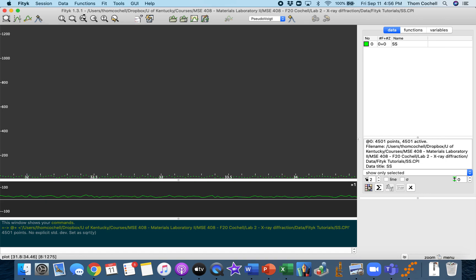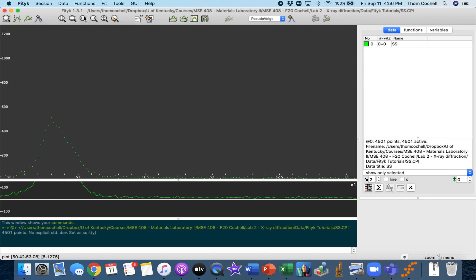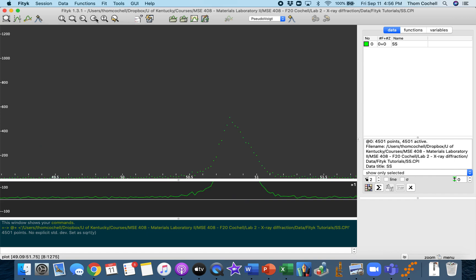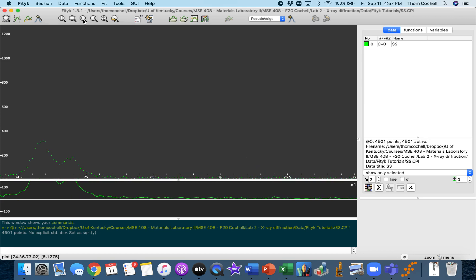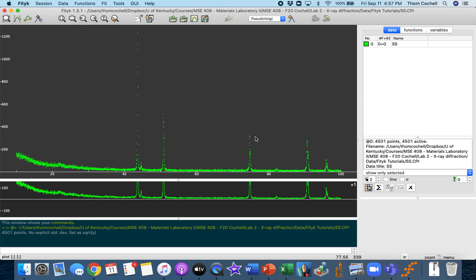Or if I go the other way, it allows me to scroll and keep going higher and higher — in this case, by hitting the left arrow. You can see that I can go through all my peaks; there's another peak. This can be helpful, because let's take a look at these last ones here.